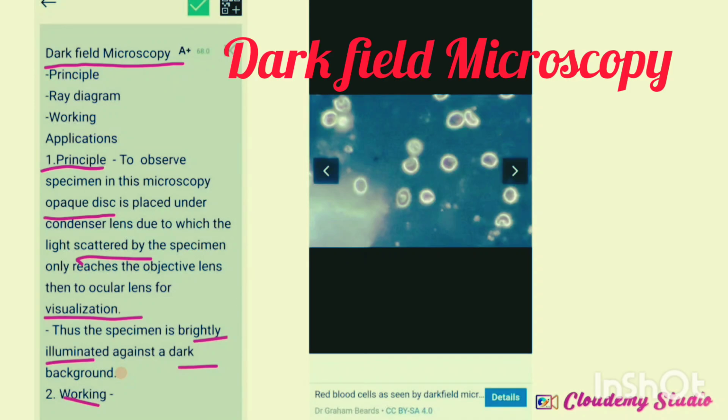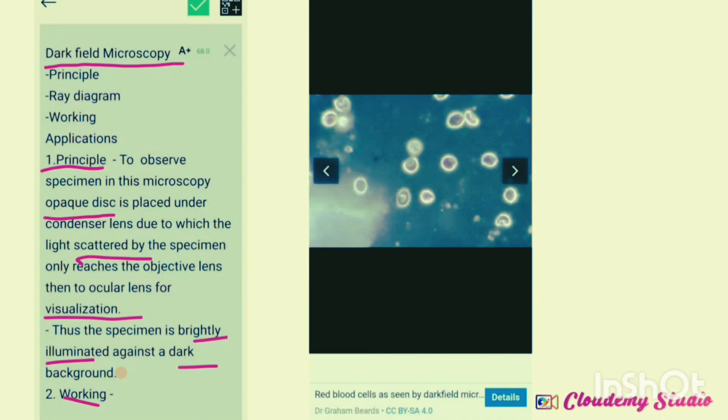Hello students, in this video we are going to discuss in detail dark field microscopy. In that, first principle, ray diagram, working and applications. Principle of dark field microscopy.